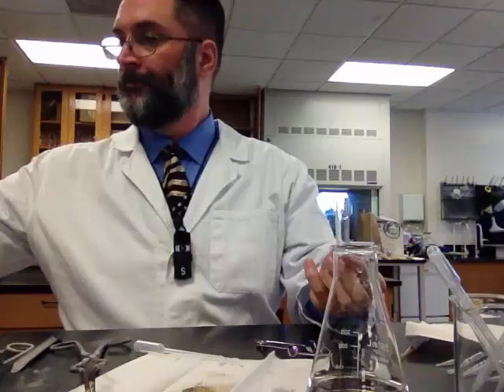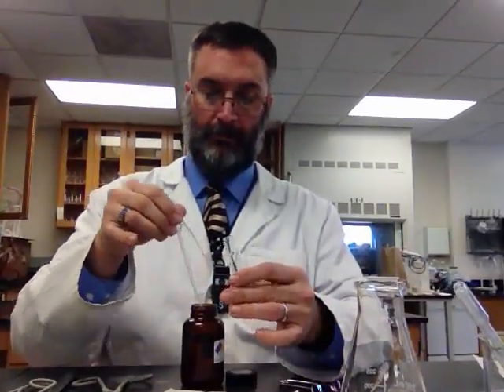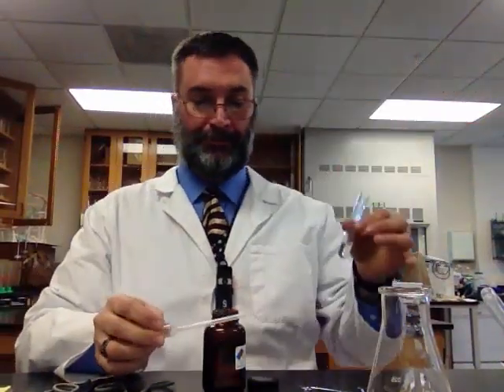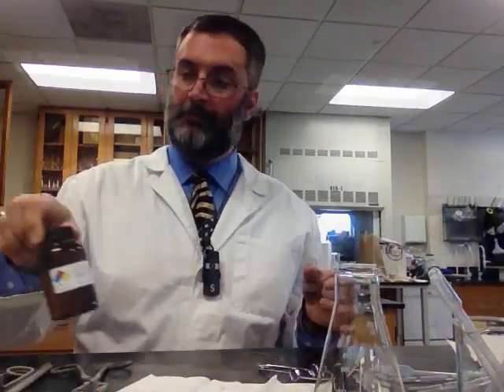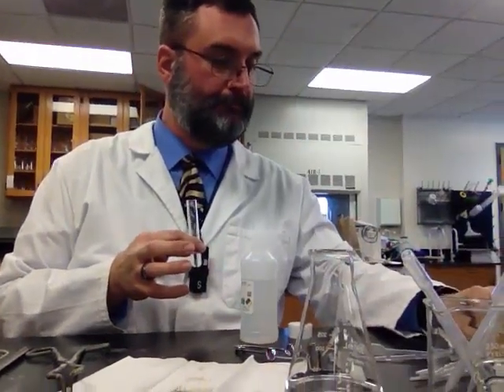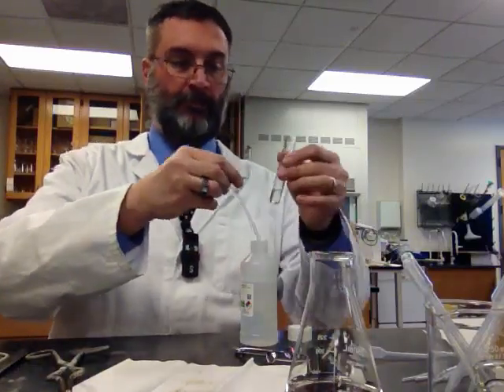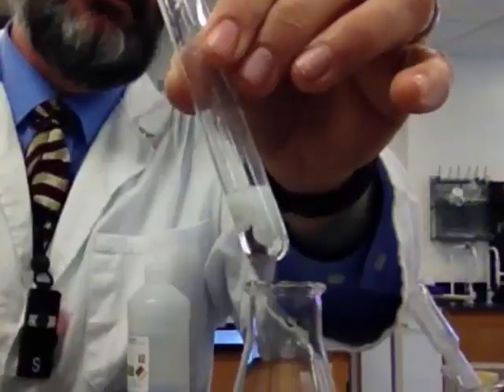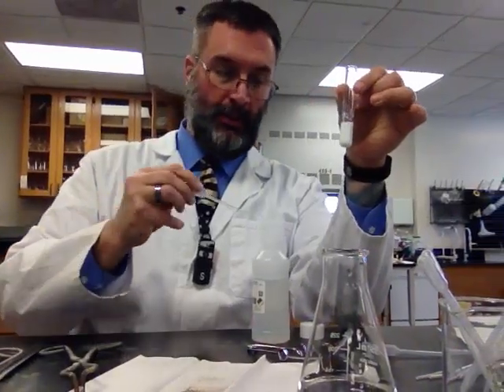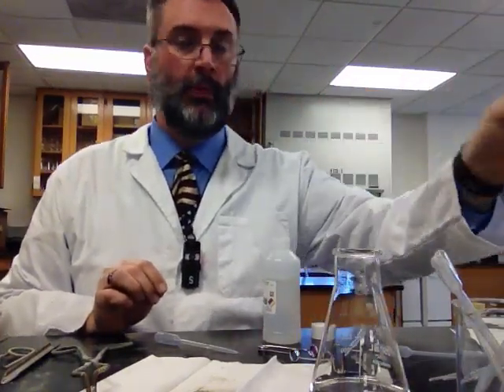Next one. Test tube. This is a solution called silver nitrate. Clear, colorless solution. Ammonium chloride. Looks a little like milk. It's not milk. So we went from colorless to white. We'll take a look at that one in a minute.